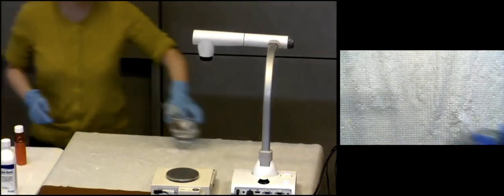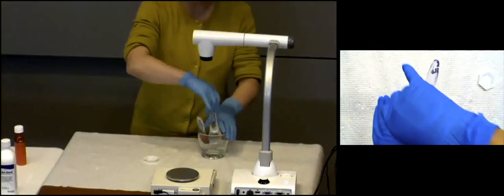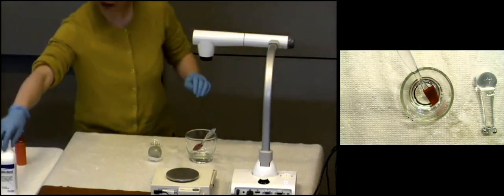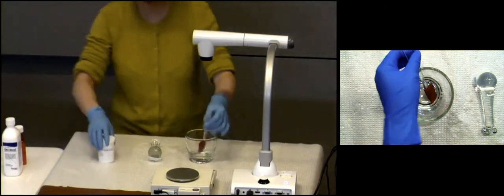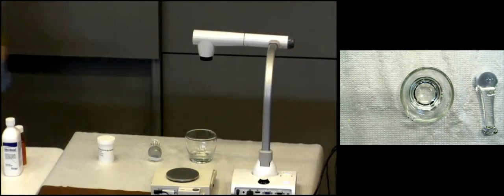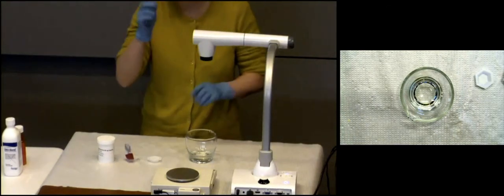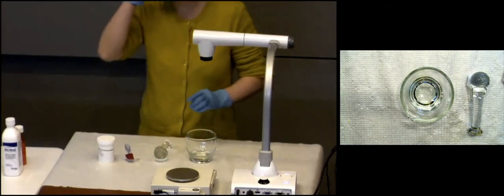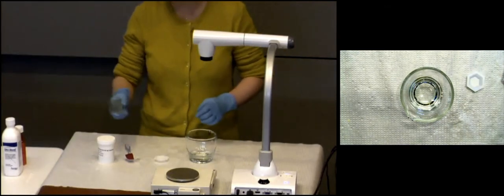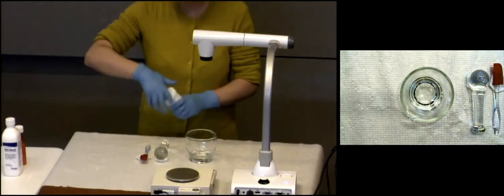Okay, so I am one of those lazy pharmacists who doesn't have a lot of time. So therefore we're going to use the ACCESS method, and we're going to use Ora-Blend as well. All right, so watch me as you guys see that. Take this into my layout here on the bench. This is the one lab where you're going to see a lot of drug on your rubber spatula as well as on your pestle. Therefore, this is really a lab where you do not want to just lay them on the bench. You're going to lose drug. Therefore, you want to hang them on the weigh boat really well. All right, that's one thing.